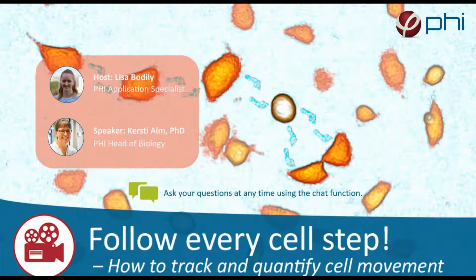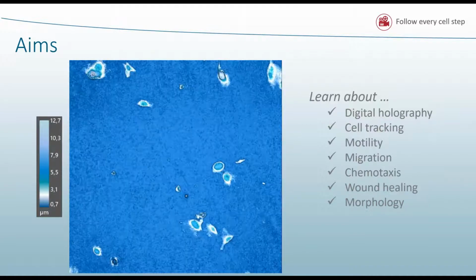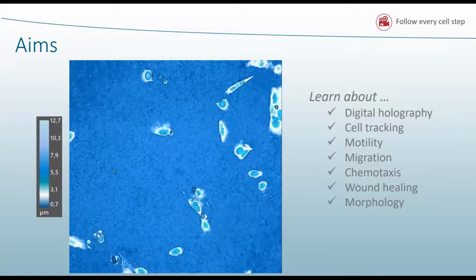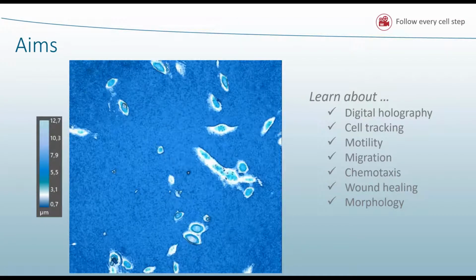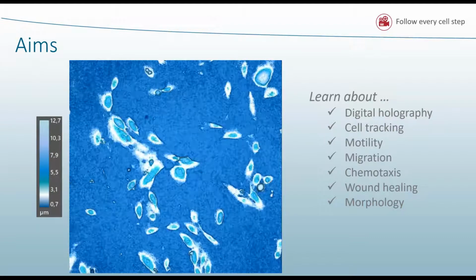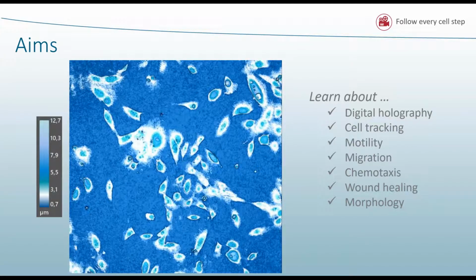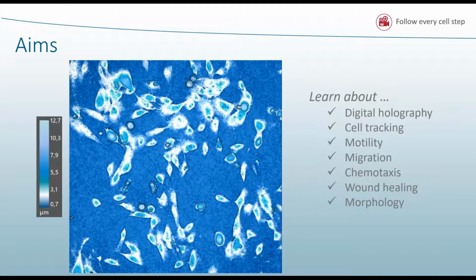Hi there, I'm happy to be here, and I'm really happy for Lisa to be hosting this. What I'm going to talk about is how cells move. As you can see in this movie here, some move a lot, others move a little. Some mostly move in circles, while others are long-distance runners. Cells move all the time. It's really necessary for embryonic development and for the everyday function of all living organisms.